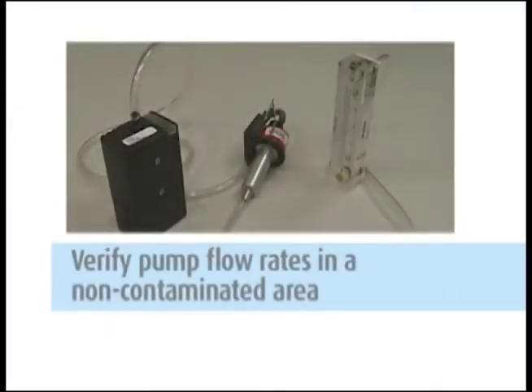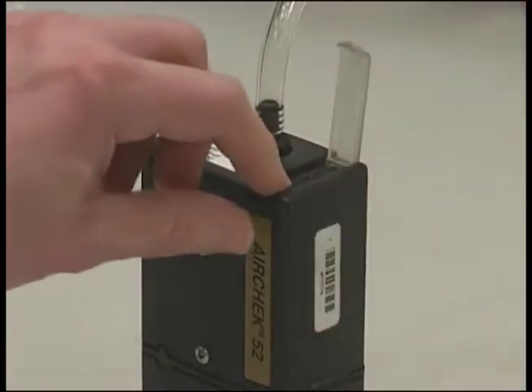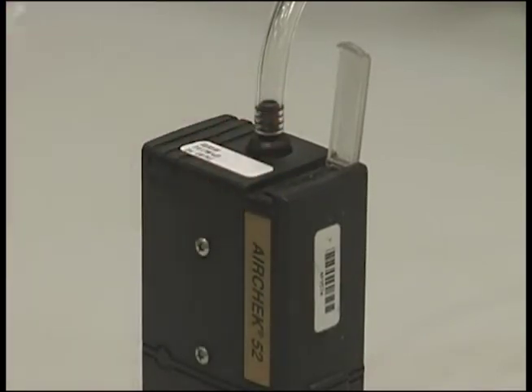Next, verify the pump flow rates in an area where you are not exposing the media and equipment to the contaminant, like an office setting. All pumps have the lab calibration information on the field pump data sheets provided. Start the pumps so they can be warming up — they need to run at least three minutes before you begin the calibration.